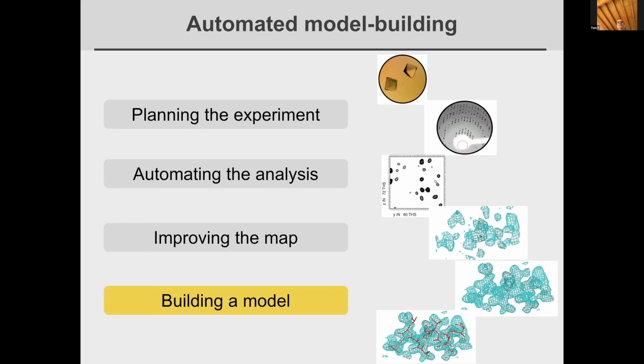a model and interpret. If you do this, there's actually a couple things to think about. So you can do it totally automatically. There's a button for that in the after molecular replacement. There's a button for doing this, and you can just do it in Autosol as well. Some things to think about are your molecular replacement model is going to bias any maps that you calculate in such a way that if your model has some errors in it, then those errors might show up a little bit in your maps.